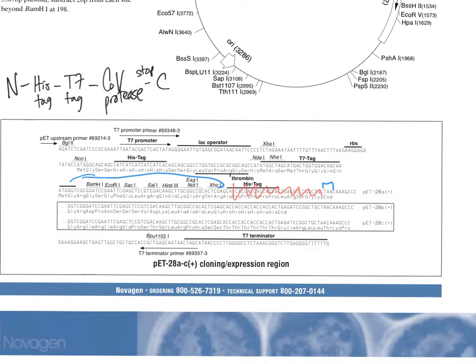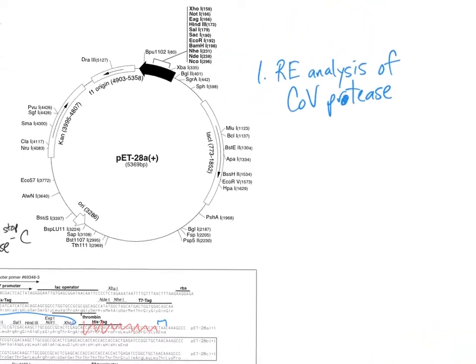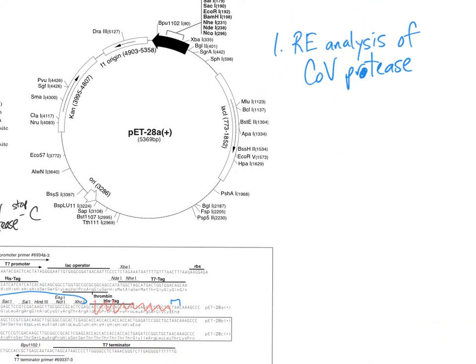Now, there are multiple ways, but let's just assume you do this analysis, and I'm not going to list them, but you've spotted your sequence on the top, and I know that my complementary sequence is there. This is my gene that I want.